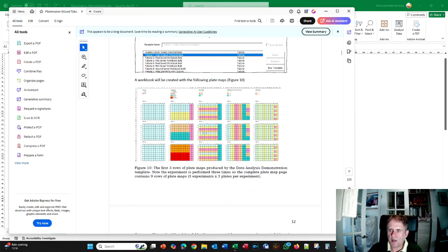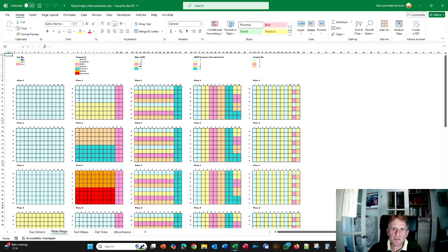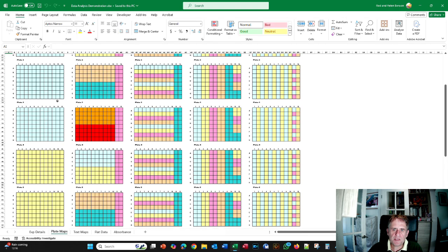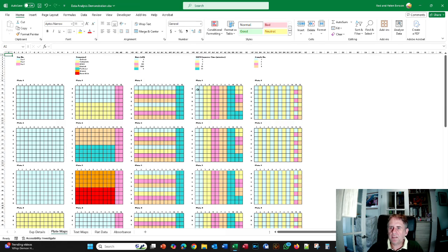Figure 10 describes the experiment. But basically, this is a time course experiment. You can see it's 3 different experiments. And each experiment has 3 plates. On those plates, there are 2 compounds each. They are tested at these log doses shown here. And this is in the presence of an EGFR time course, the time course running this way.